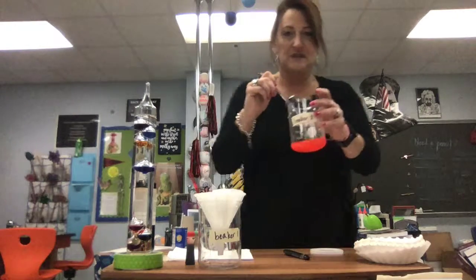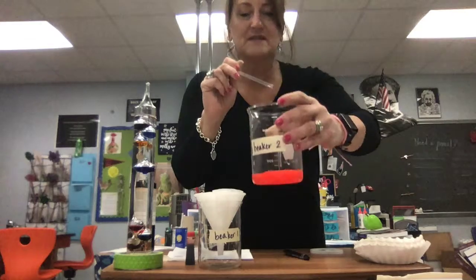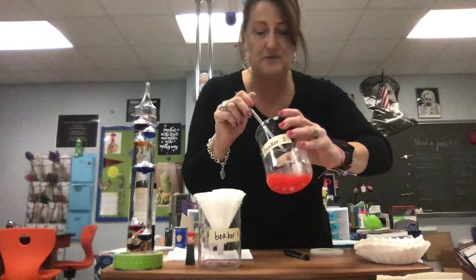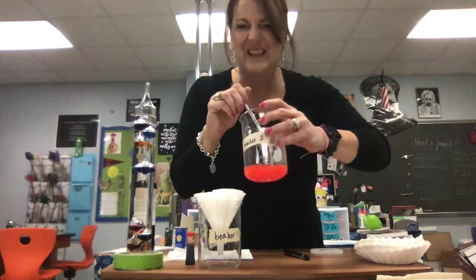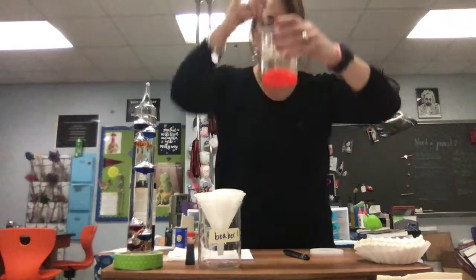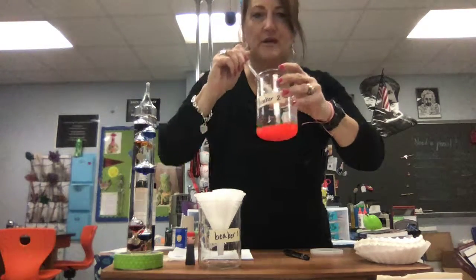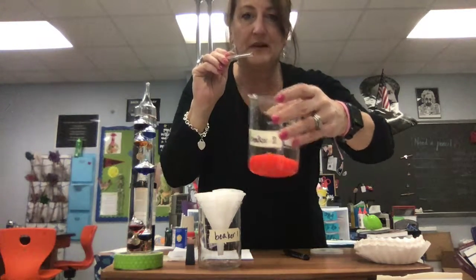Okay, so now that just got kind of murky, right? Murky is like the pond that you jump in and you can't see the bottom. You can't see through it. It's not very clear. Make sure I get all that cornstarch. There we go. Okay, so now I've added cornstarch.